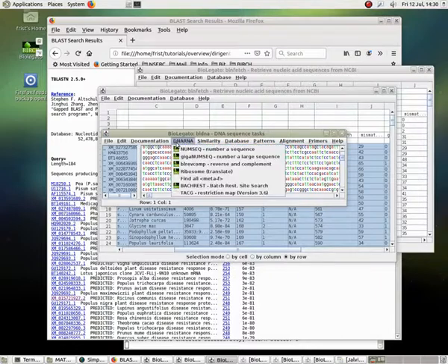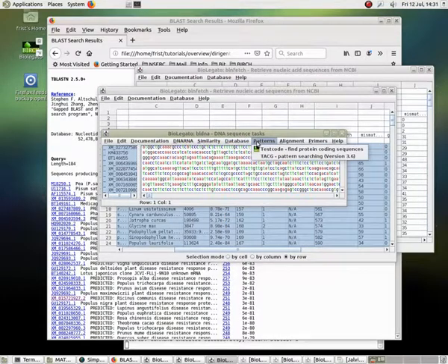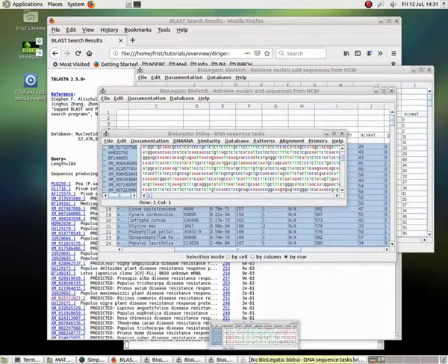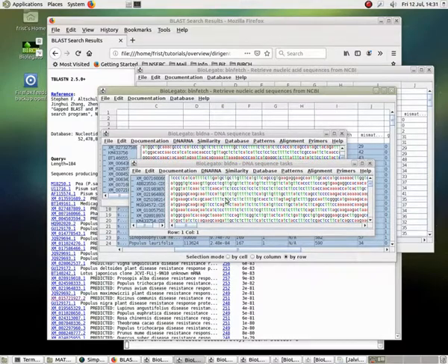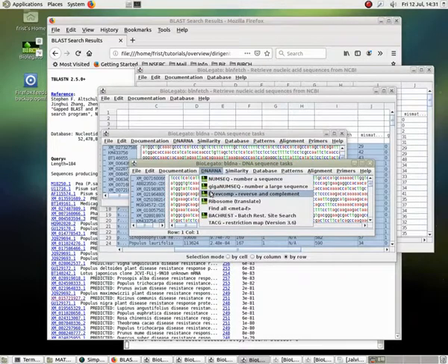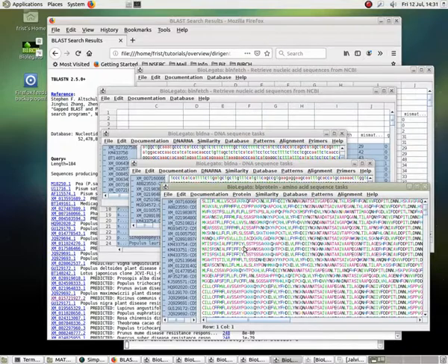So here, as you can see, we have a lot of different sequence tasks that can be run on the raw DNA sequences we've retrieved. If I wanted to get a multiple alignment of the proteins, then what I really want to do is run BioLegato to get the coding sequences extracted, and then, having the coding sequences extracted, I can run ribosome to get the actual amino acid sequences, and then use MAFFT to get a protein alignment.